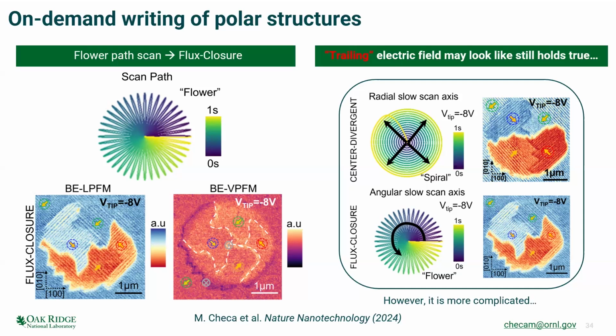Now you can start calculating radial speeds and tangential speeds. This will depend strongly on what spiral you're patterning. I can do spirals with 4 inner spirals, or spirals with 22 inner spirals, and then the local velocities will be strongly different. So you can match it with the slow scan speed of a raster scan if you want.